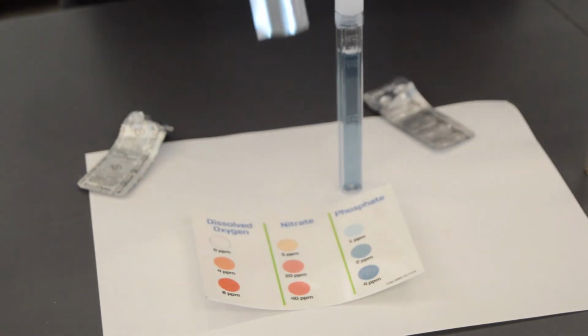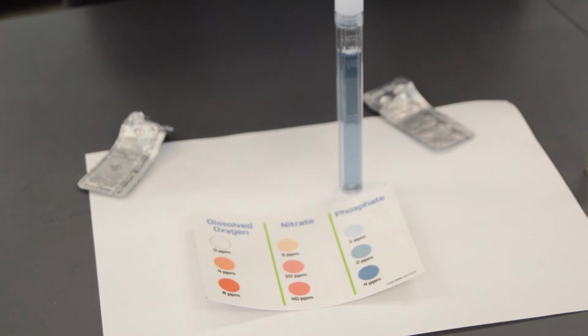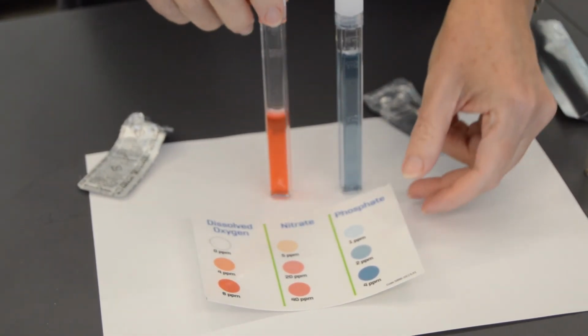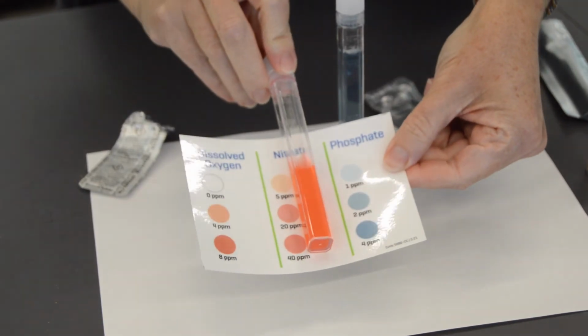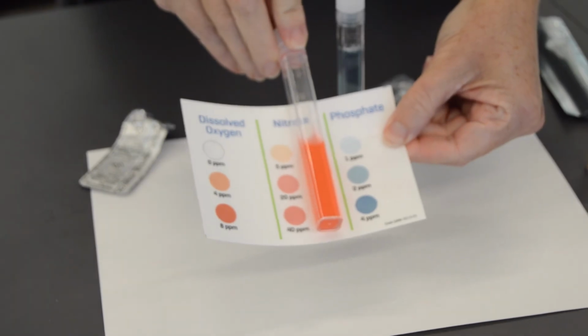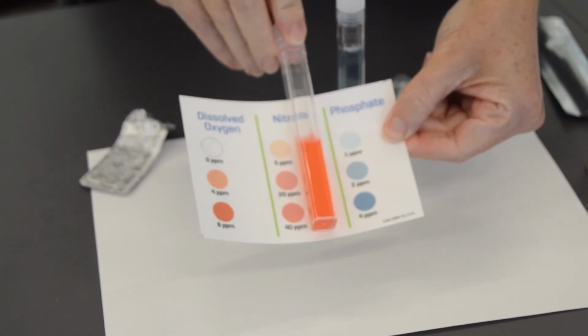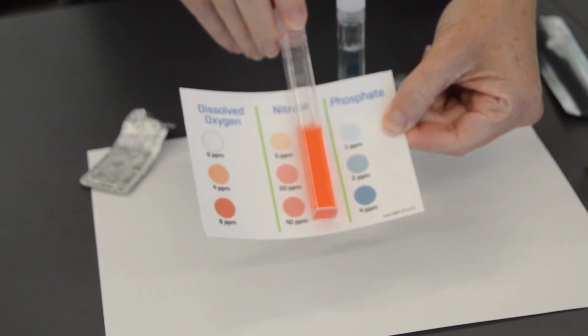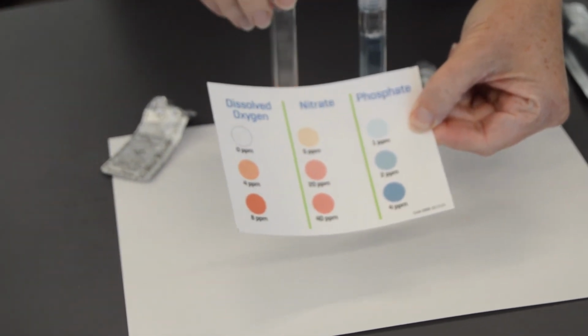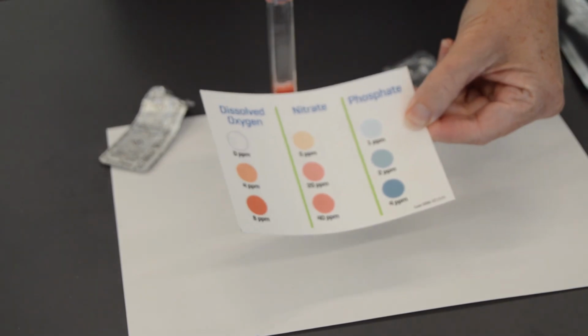All right, so we allowed our tests to develop their color. And so you can see our phosphate is pretty intense, and our nitrate is significantly higher than it was before. So the nitrate is actually showing up potentially above the 40 ppm level from the potting soil. So we picked up a lot of nitrogen, which isn't surprising. Potting soils typically have a lot of nutrients, such as nitrogen, so you have high nitrate levels.